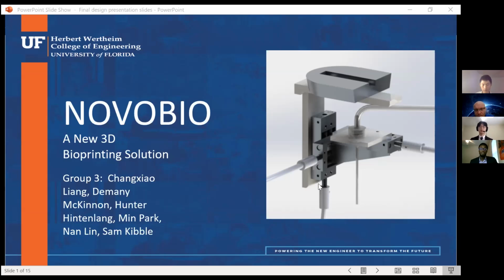Since it's flexible, it will bend in other directions, and in order to not cause interference with the microscope working place, the length of the printing tip will be enlarged in order to reach the well plate, based on the real situation of the microscope.